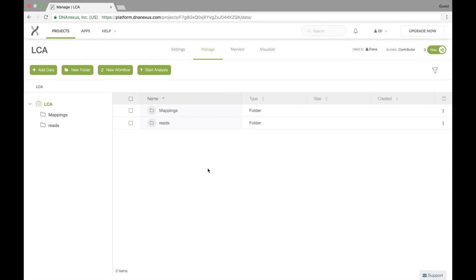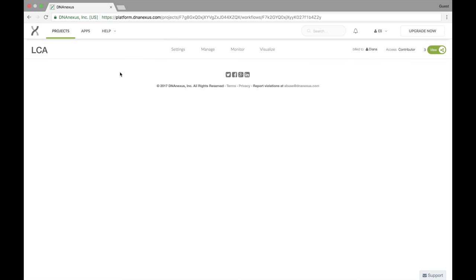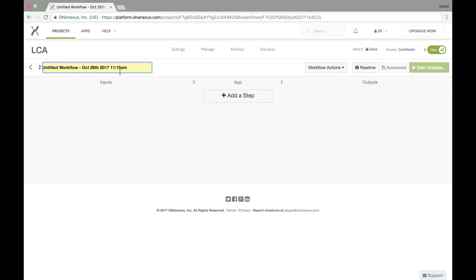To create a new workflow we simply click on the new workflow button. This will take us to the workflow edit view. In the upper left we can set the name of our workflow, which in this case I'll call it DNA-seq.